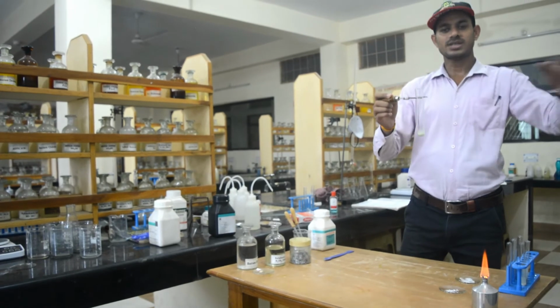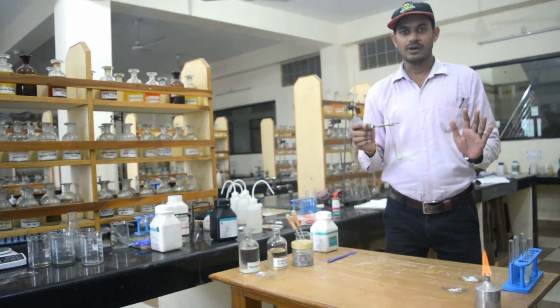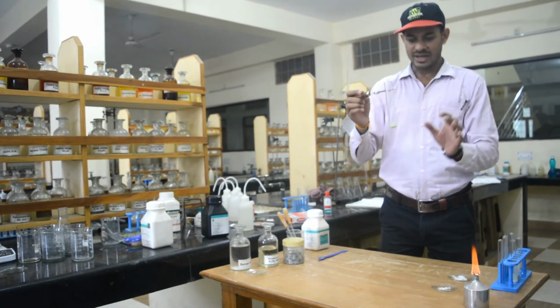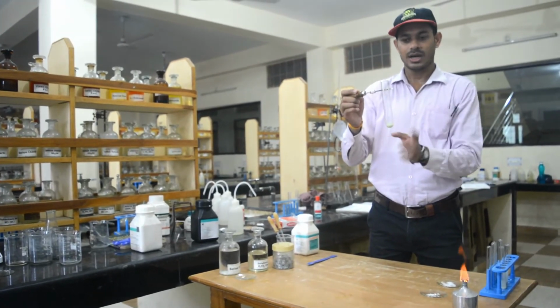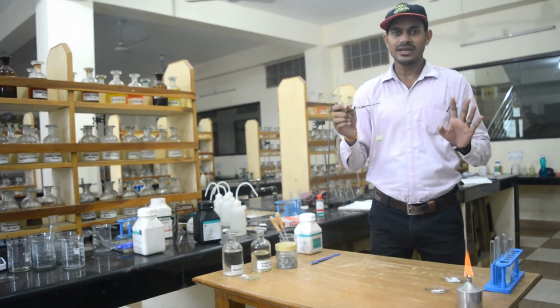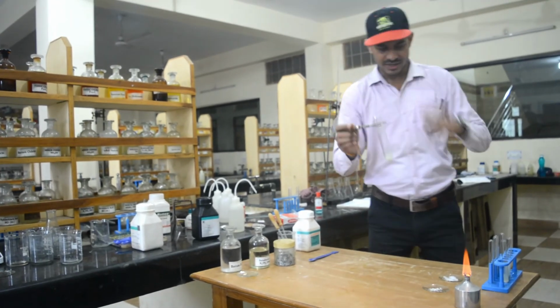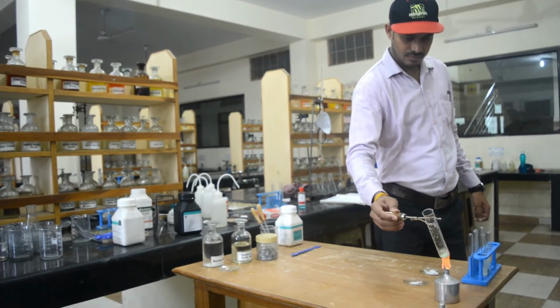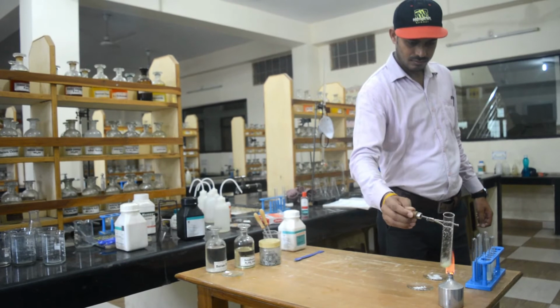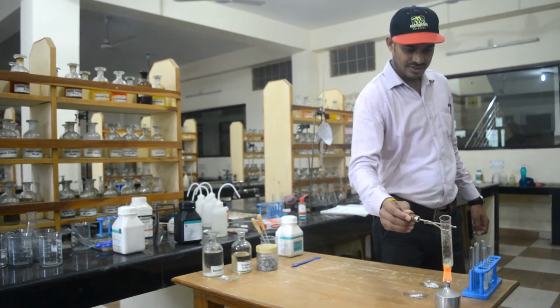Now students, we will see one experiment of decomposition reaction. For the decomposition reaction, I have taken ferrous sulfate salt in this boiling tube and I will heat it. Let us see if any change is observed in the ferrous sulfate on heating. You can see it is green in color. Ferrous sulfate is green in color.